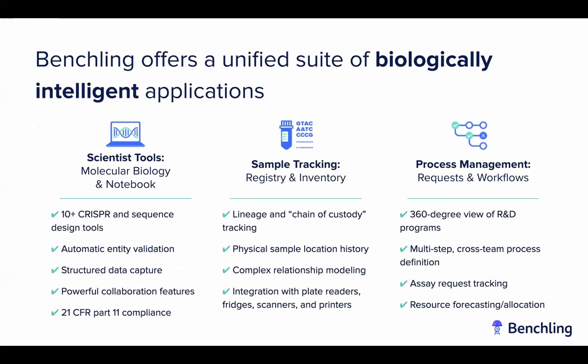We have a registry system that allows you to not only store your DNA and proteins, but other pieces of data that you would model, such as cell lines, viruses, containers, refrigerators, freezers. We have an inventory tracking system that will track the physical manifestation of all of these samples in your lab. We also have process management tools to manage requests that transit across teams, as well as a workflow tool for high throughput experimentation. We're primarily going to be focusing on the molecular biology tool today.